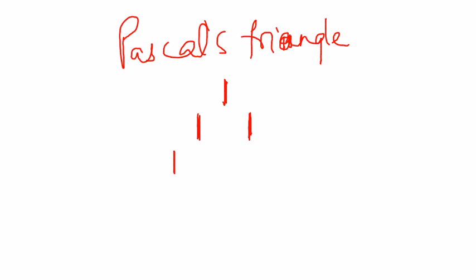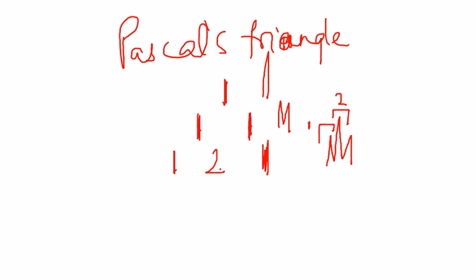If this was a triplet, 1 plus 1 is 2, and you write 1 again, so a triplet is such that the middle one has double the intensity of the side ones. Doublet means both of them should be equal intensity. Singlet means only one peak.